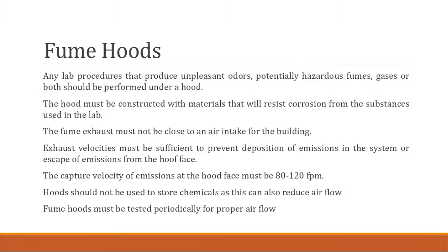Well, pretty self-explanatory. They're there to help remove any of the unpleasant odors, fumes, and gases that are going to be produced in the lab. You don't even need to have something react. Just some chemicals have a very strong, unpleasant odor, which can make you nauseous right away.